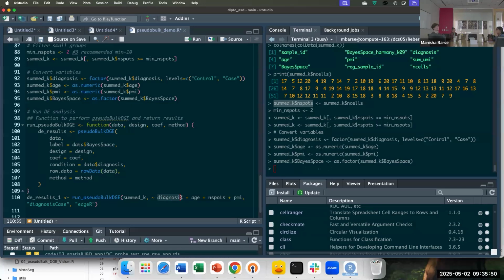Imagine how the model matrix creates the different columns. The first one is the intercept, and the second one is basically the first covariate that we give to the formula. And then you can experiment with writing this formula. It can be an interaction model, or it could be testing different covariates altogether.